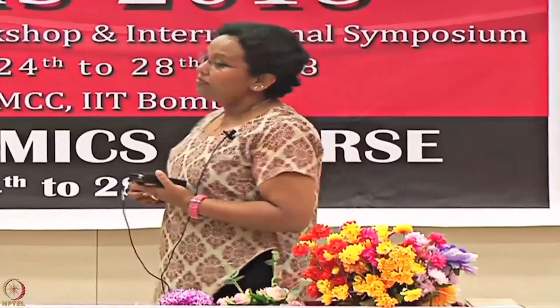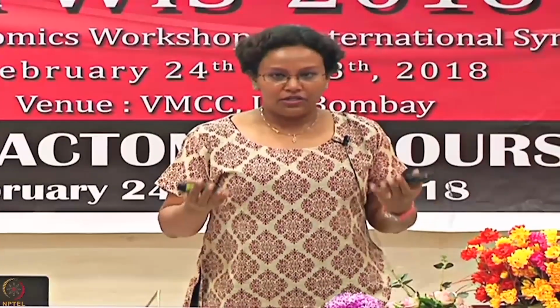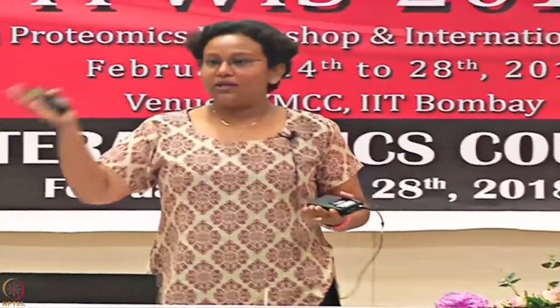Okay. What to immobilize? We come back to the question of which one to immobilize. So, the first thing that you would like to look at is actually the molecular weight of the interactant. Which one would you think should go as a ligand? If you have two interactants and one of them is large and one of them is small, which one would you like it to go as a ligand? The small one, absolutely, because you can use the larger one as an analyte.